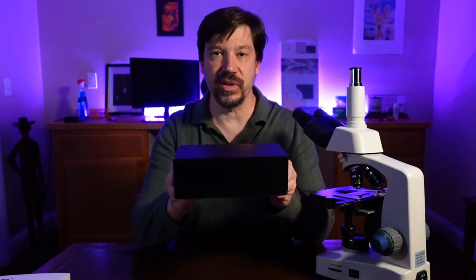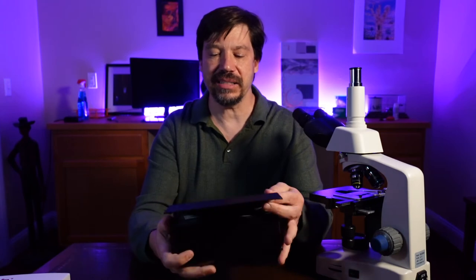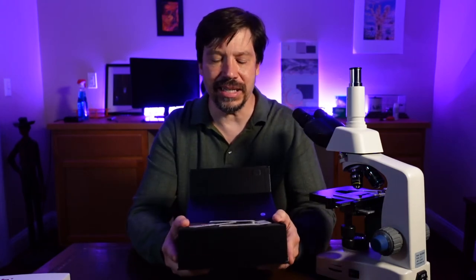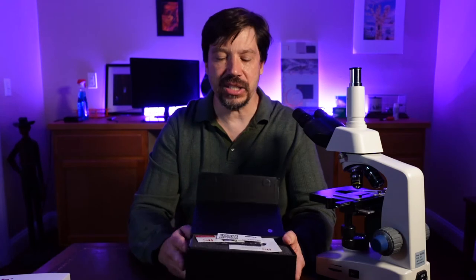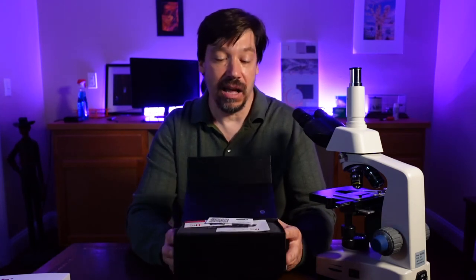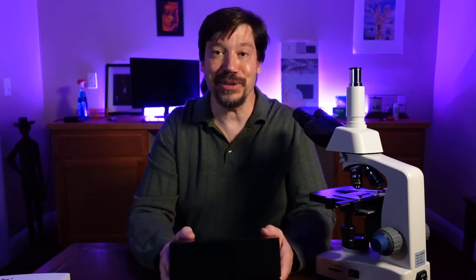This is a funny start but this is a really nice box and one you might actually use for storage. It has a magnetic seal to it and the shock insulation inside is really solid, so it's very easy to remove from the package and very easy to put back in. This is one I'll definitely be using to store this particular device — I'll just close it up, throw it in a cabinet, and it'll be nice and safe and secure.